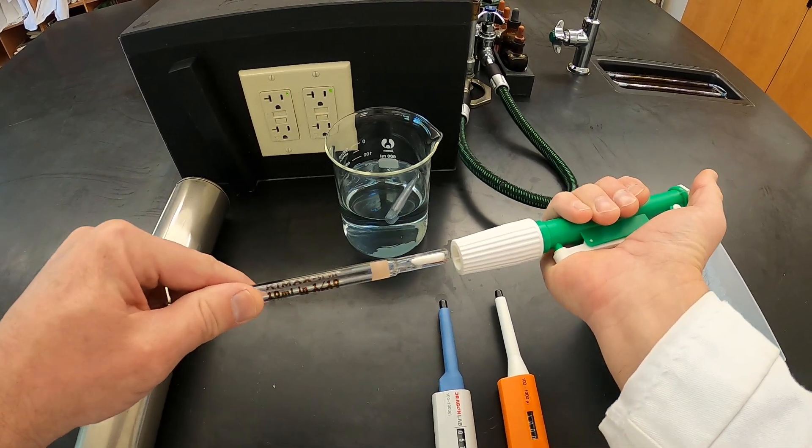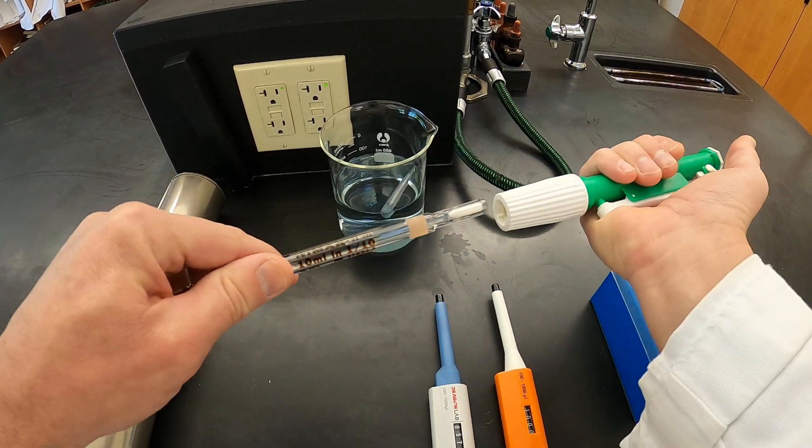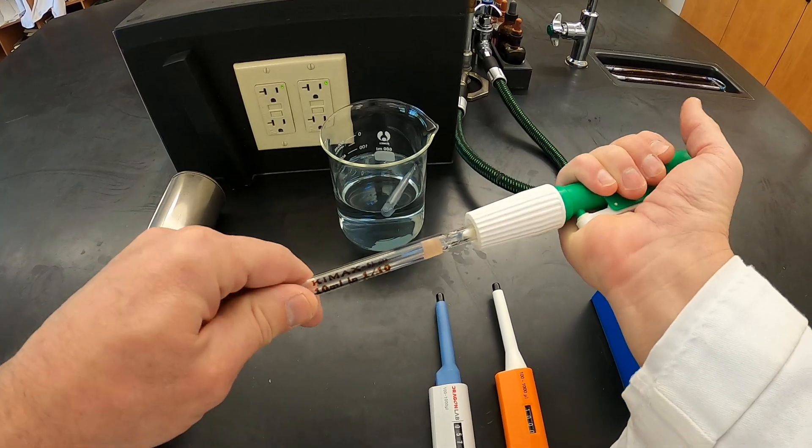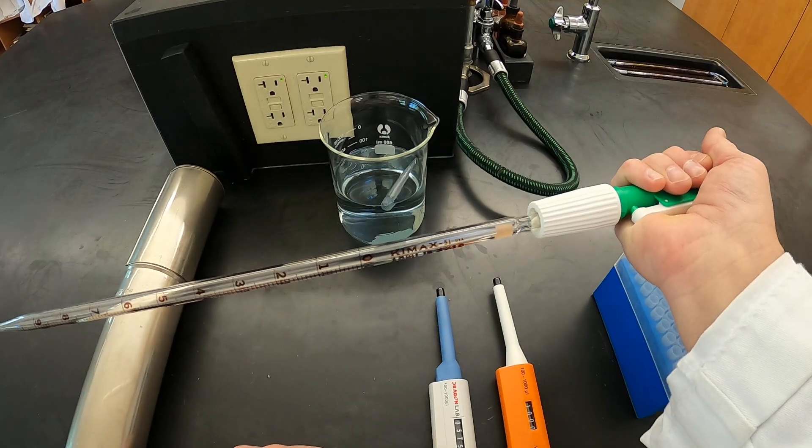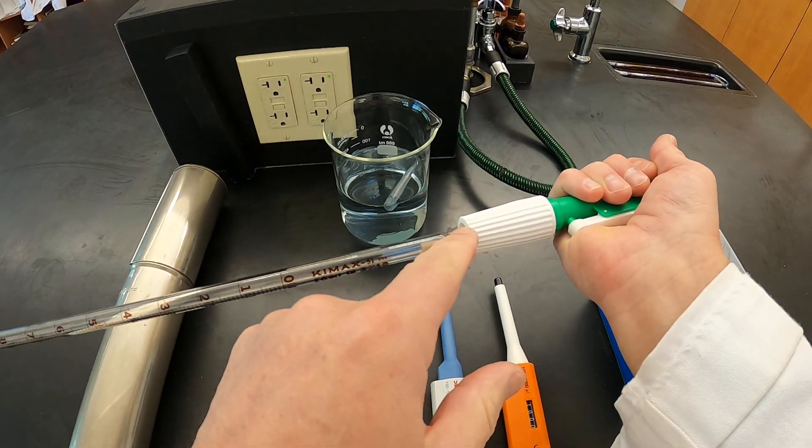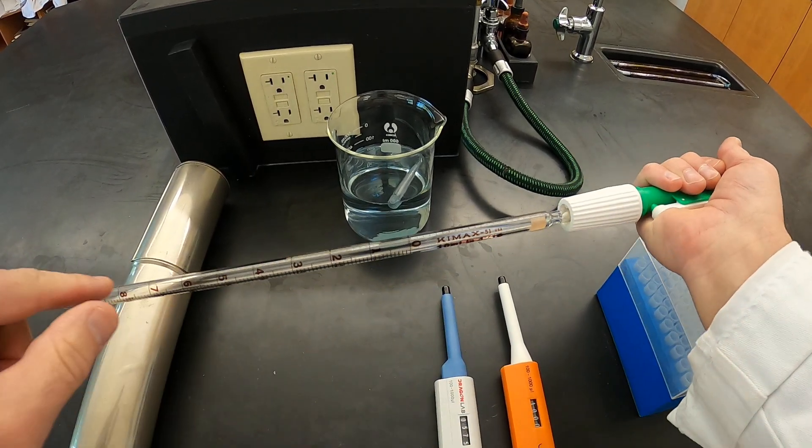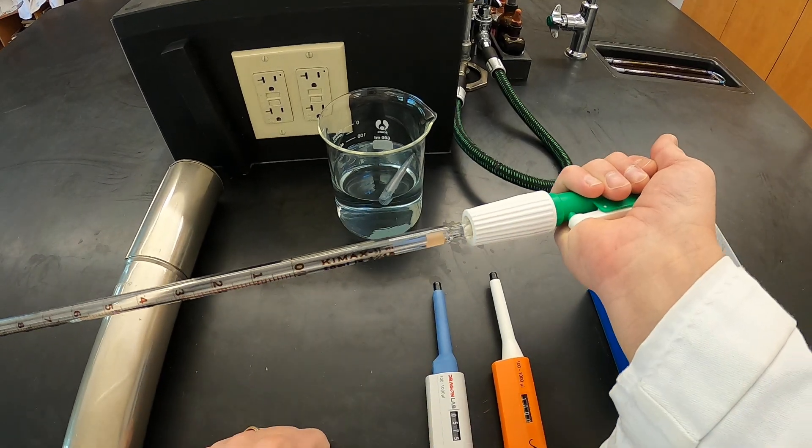What you're going to be doing is you're going to be shoving the end of the pipette carefully into the pipetting device and give a little twist just to make sure you've got a nice secure seal on here. If you get leaking with your pipette, then you need to go back and check your seal again.